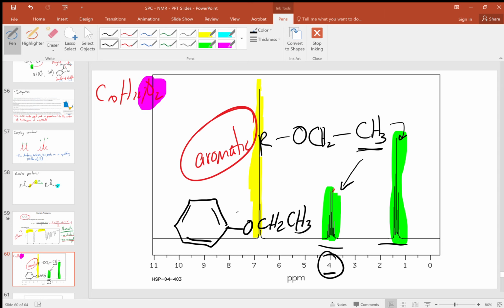So we're almost done, but we've still got 2 carbons to account for. We've used 8 of the 10 carbons so far. Well, if I go back to this aromatic peak here at around 7 ppm, one of the things I notice is that it's a singlet. Because it's a singlet, that means that all of the hydrogens in the aromatic ring have to be equivalent. Well, if you think about what's left from our initial starting conditions, we still have an oxygen, we still have 2 carbons.